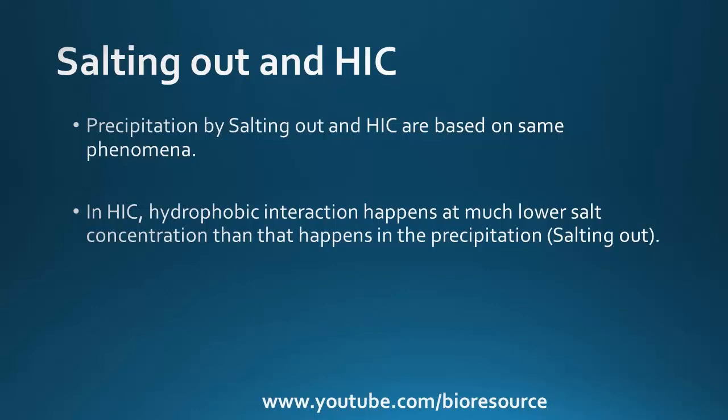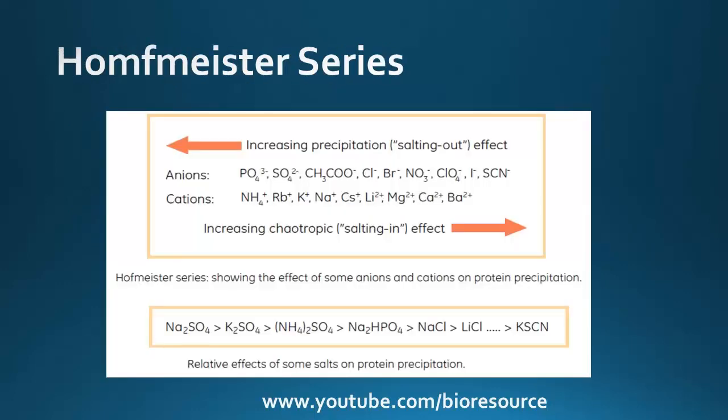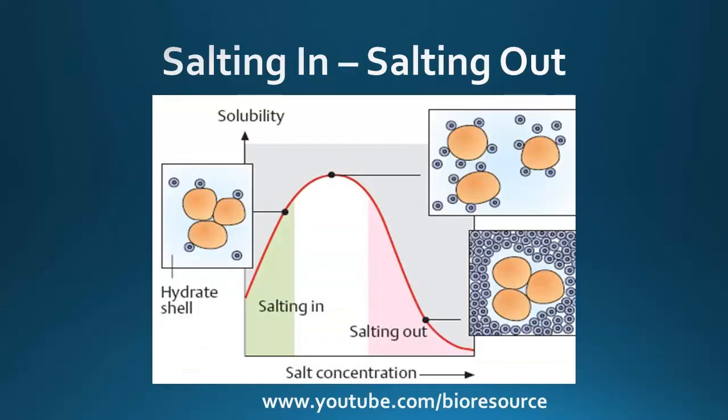The elution or precipitation strength of an ion is described by the Hofmeister series. Small highly charged ions are strong precipitants, whereas organic acids and bases have a more stabilizing effect in the presence of proteins in solution. The term chaotropic refers to the ability of an ion to produce chaos in the water structure. The anti-chaotropic salts such as ammonium sulfate and sodium sulfate expose hydrophobic patches on protein by removing the highly structured water layer, which usually covers these patches in solution. As a result, hydrophobic residues on the protein molecule can interact with the hydrophobic ligand of the matrix.